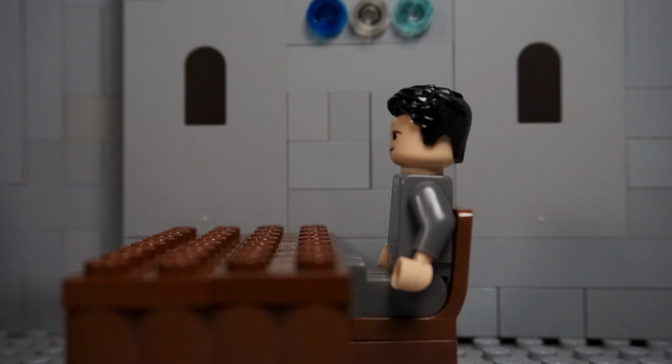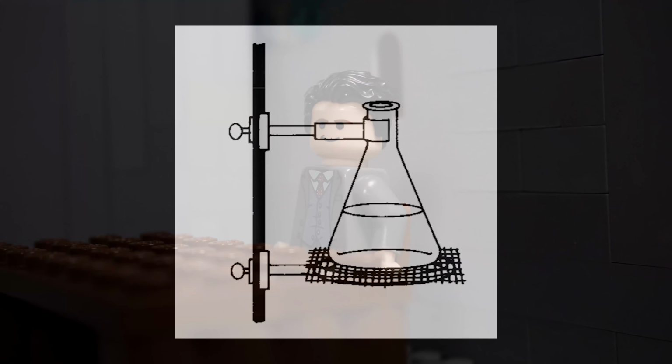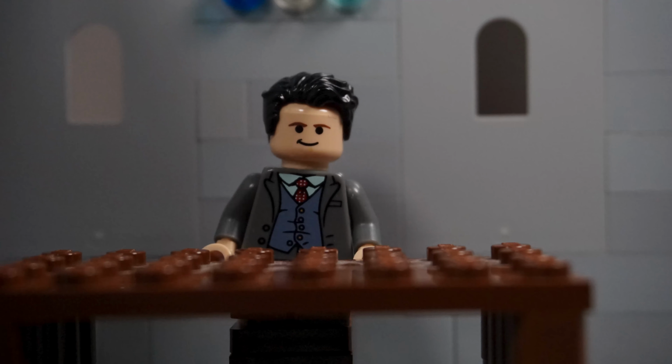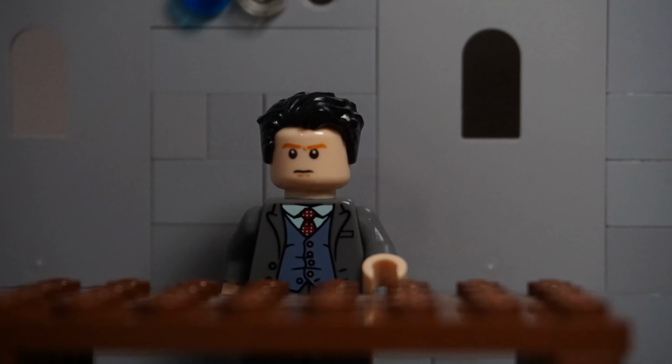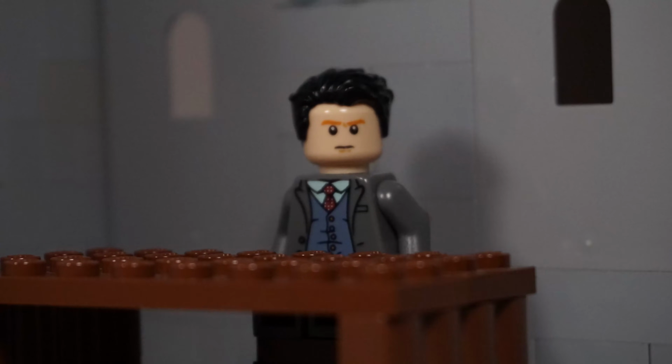The most common injuries result from glass not being handled correctly, or students touching an apparatus that is still hot. The apparatus should be secured by a metal ring, and it needs to be sturdy. If it is not secured, then it can tip over and spill chemicals all over. Report any injuries like this to your teacher and go to the nurse as soon as possible. They may look fine, but they can be very dangerous if not treated properly.